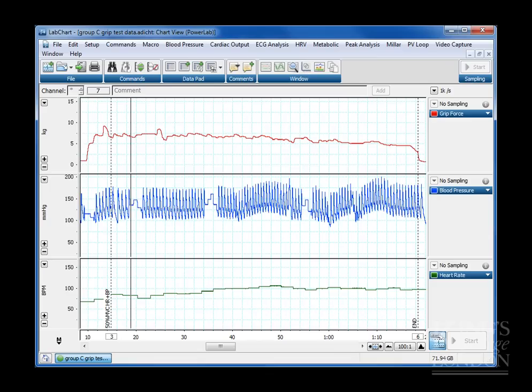We'll start fairly simple and work our way through a number of data files showing the uses of LabChart and Excel to do some analysis of data. We'll start by just showing you the data sets we're going to be using.